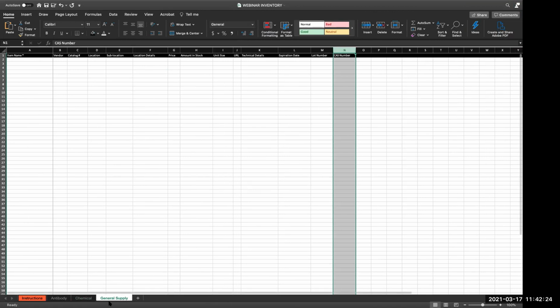If you go to your general supply sheet, all of these fields are going to be included in each and every type.